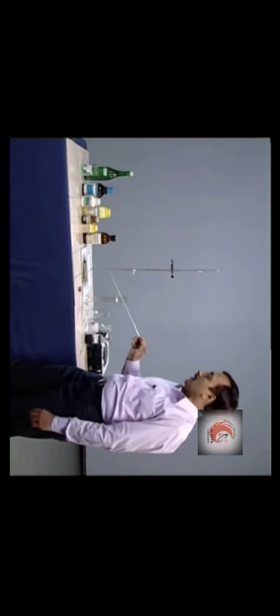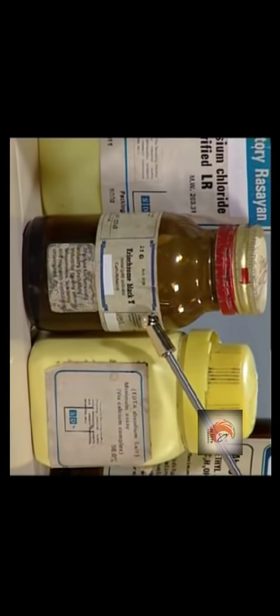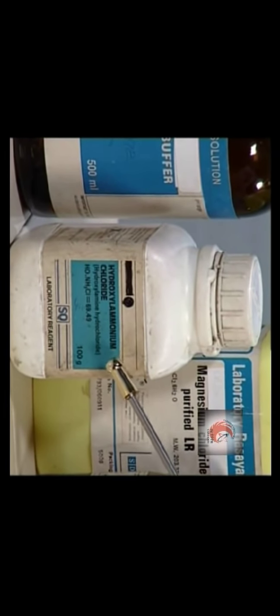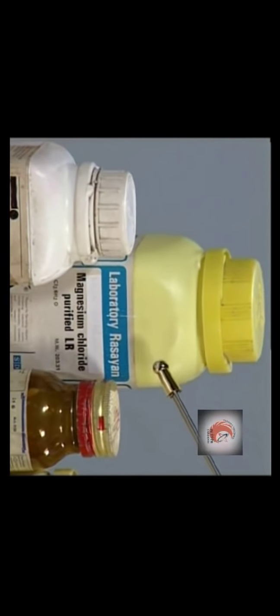The reagents required are sodium salt of EDTA, Eriochrome black T, hydroxylamine hydrochloride, ammonia buffer, magnesium chloride and 95% ethyl alcohol.